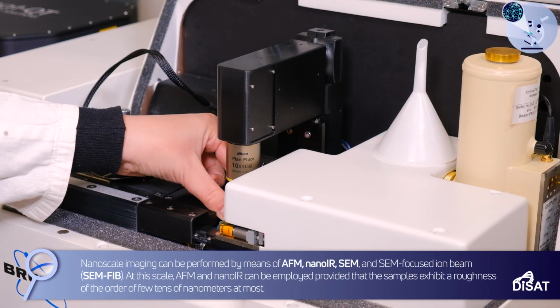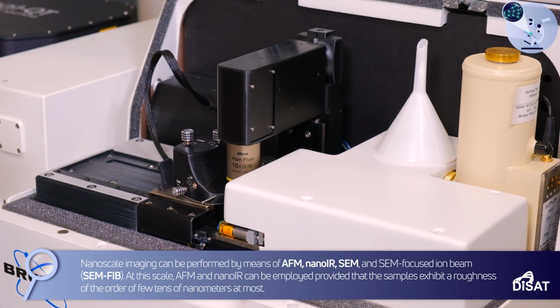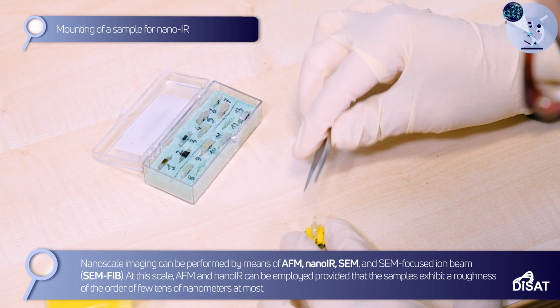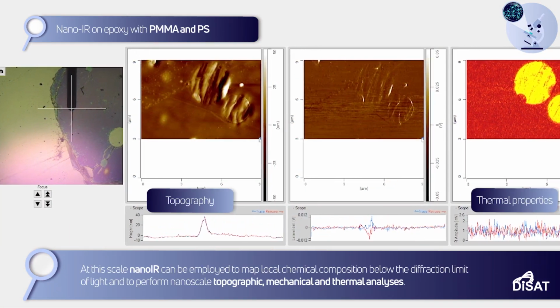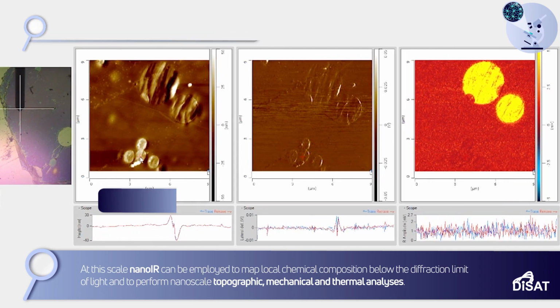Nanoscale imaging can be performed by means of AFM, nano-IR, SEM, and SEM-focused ion beam. At this scale, AFM and nano-IR can be employed, provided that the samples exhibit a roughness of the order of few tens of nanometers at most. At this scale, nano-IR can be employed to map local chemical composition below the diffraction limit of light, and to perform nanoscale topographic, mechanical and thermal analyses.